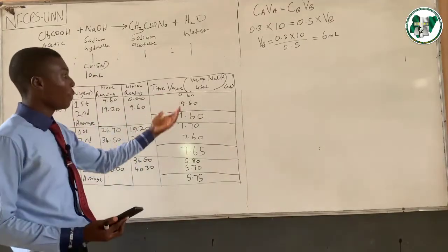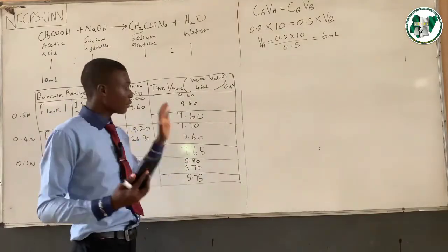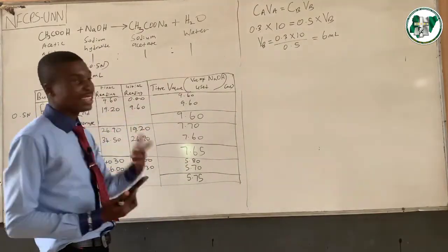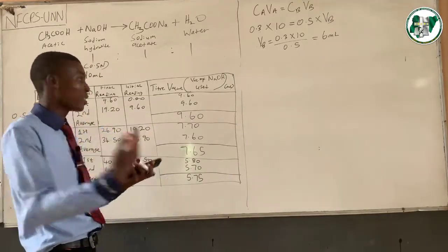That is about 0.4 mil lost in reaction, in terms of the amount of adsorption that took place. Let me explain that quickly.